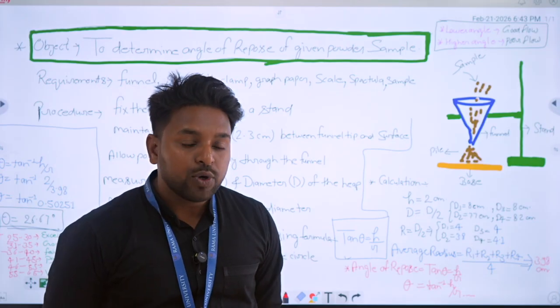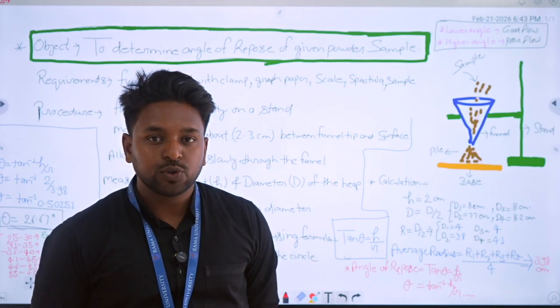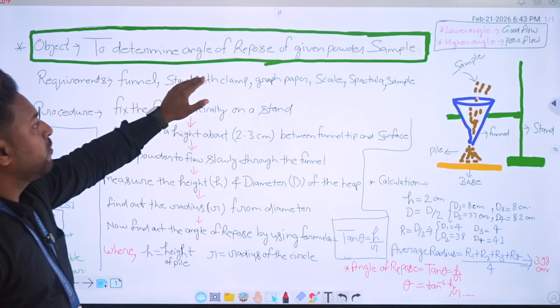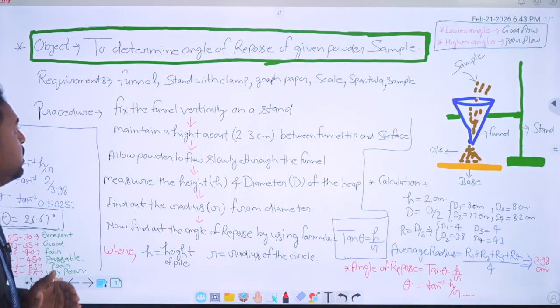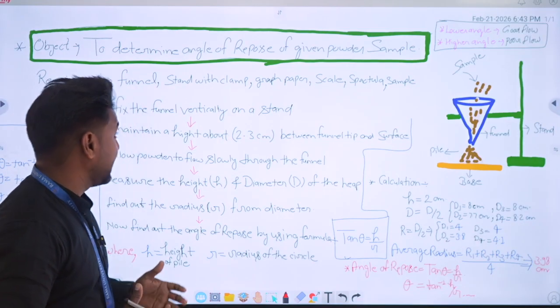Today I am going to deliver a lecture on angle of repose. So let's start. Object: to determine the angle of repose of a given powder sample. You can take any sample whatever you want. Then we are going to find out the requirements for the practical.